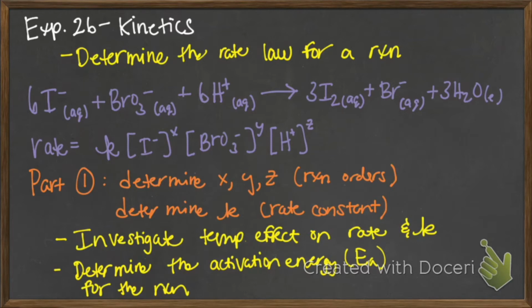So this is done in part 2. So in part 2, we will change the temperature and see how that affects the rate and the rate constant, and then use that data to determine the activation energy for the reaction.